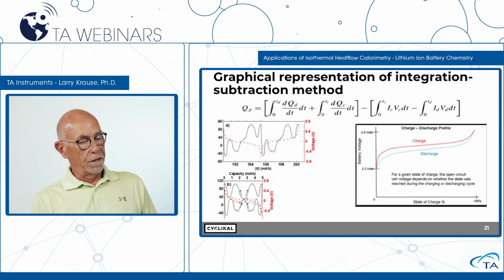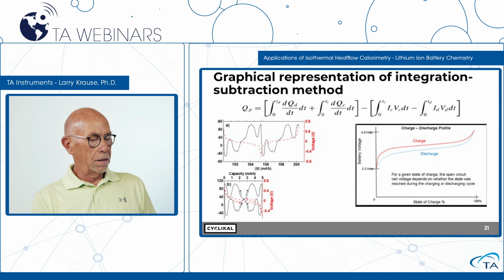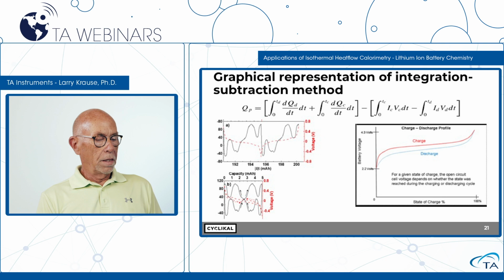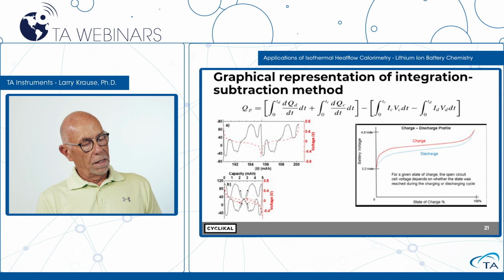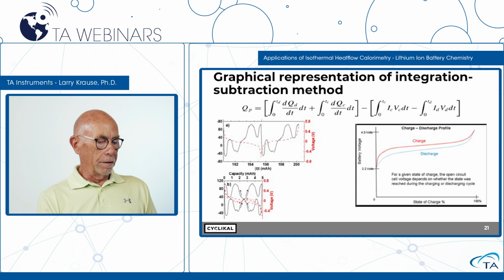So this panel is the total thermal response from the calorimeter, from the TAM. We may charge the cell as so, and here are the actual thermal measurements. Right in the middle here, it goes from charge to discharge, and we discharge it. Now to show you what happens here, if I take right in the middle and take the data to the right and roll it back over on the left, which I've done down here, see the arrows, I come up like this, go to my top of charge switch point and start discharging it, you see the arrows coming back. Notice how symmetrical that is?